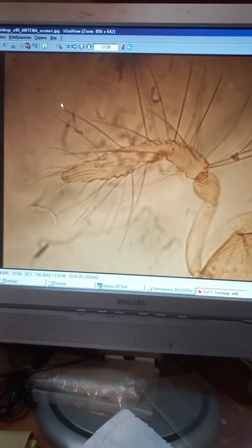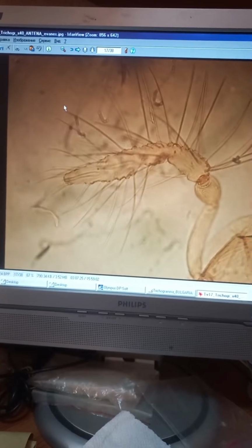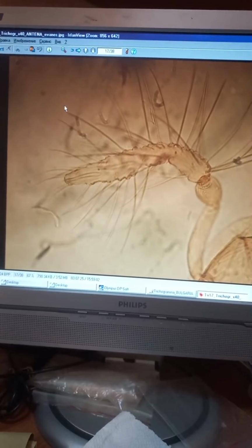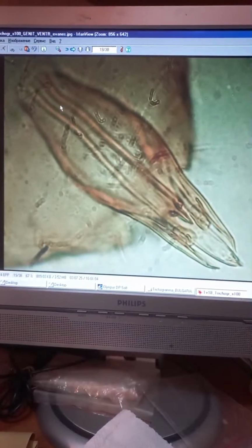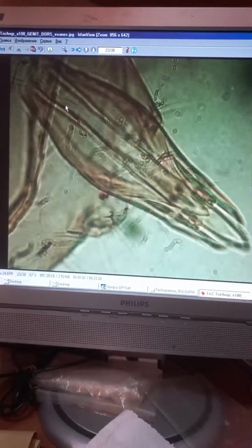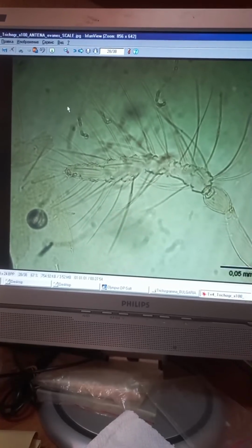Here very long antenna and very long setae, 3.5-4 times longer than the maximum width of antenna. Very long setae. 400 magnification. Genitalia, intervolsellar process, ventral part and dorsal part. Again, dorsal part of genitalia, very long setae of antenna.